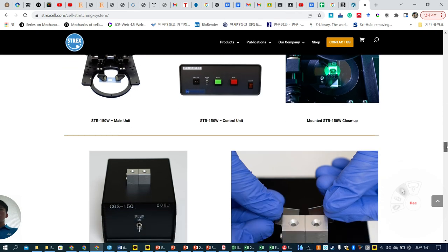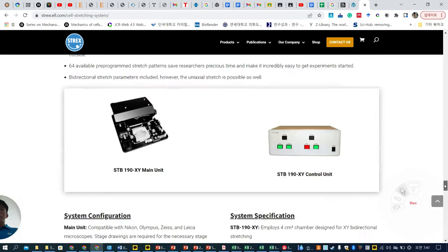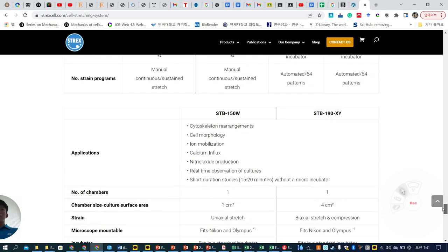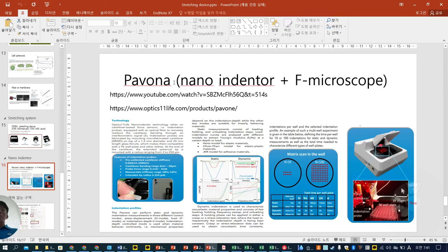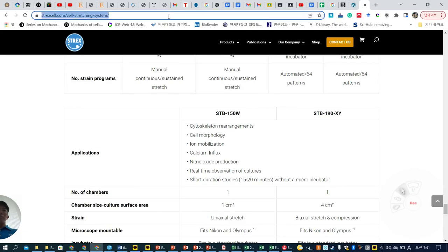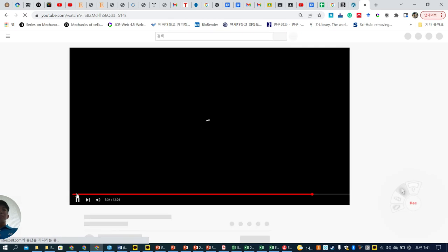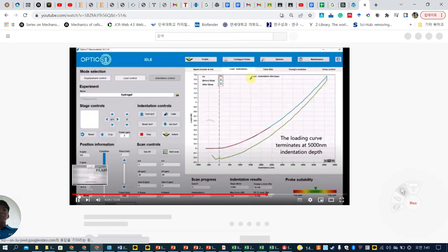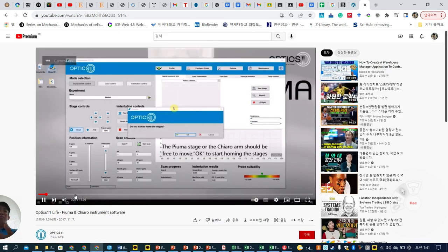And then, yes, like that. So the last one is the Pavona single cell level nano indenter with the fluorescence microscope. Let's visit YouTube for an easy explanation. So they can show how you can measure something. They have very great software.